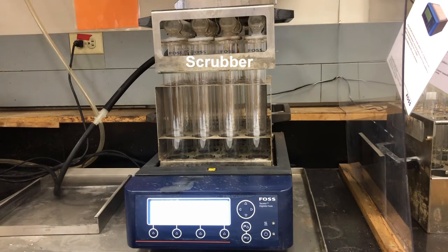What that does is take care of any of the harmful fumes or vapors that are given off when it starts to heat up. Remember, we put concentrated sulfuric acid in these tubes. When the sulfuric acid heats up, it's going to give off a lot of vapors, and we don't want to be breathing that in. So the scrubber takes care of those vapors and neutralizes them before releasing it into the fume hood.